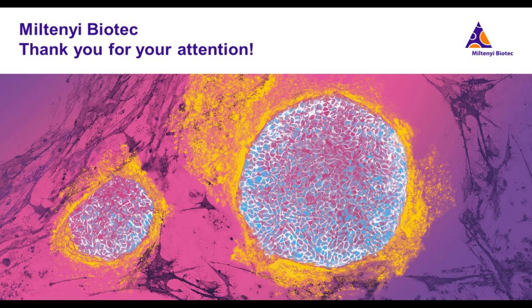Thank you. All right, your next question is, can we process paraffin sections or cryosections to utilize this imaging system? The processing of the sample is, of course, done outside of the MACSima. The MACSima is performing every step fully automated, but the sample has to be processed outside.